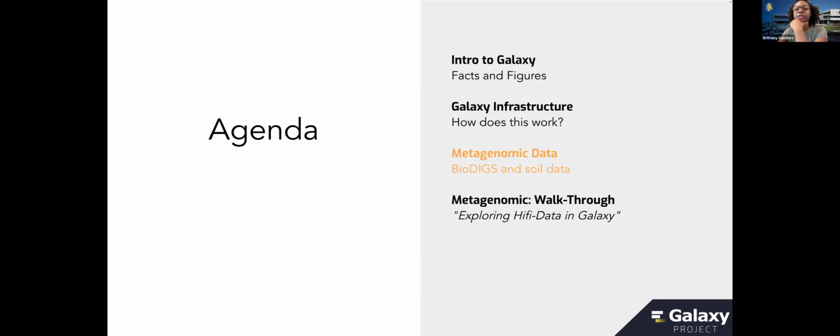We have one more question from Kiki Parker. She asks, can Galaxy be used to perform p-value calculations or t-test analyses? Yeah, absolutely. Today we're going to be talking mostly in the context of metagenomics. We'll see a little bit of stats when we talk about species abundance, and a little bit about the p-value and e-value of protein alignments.